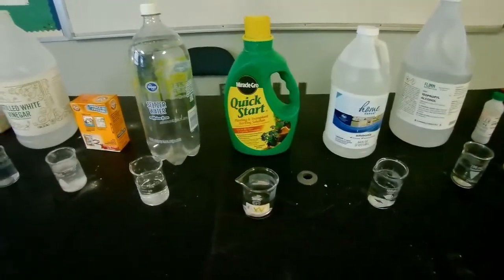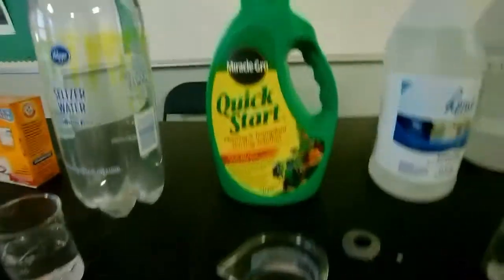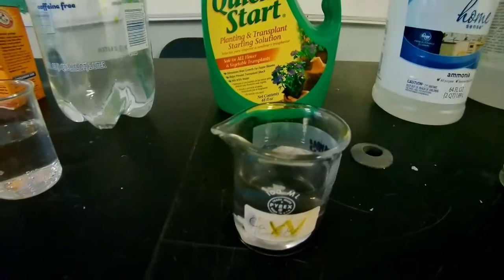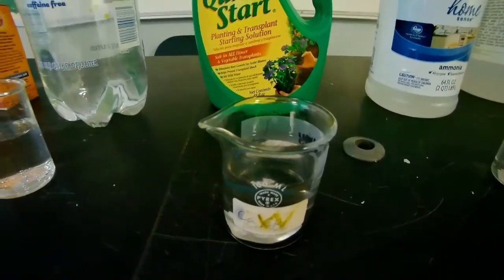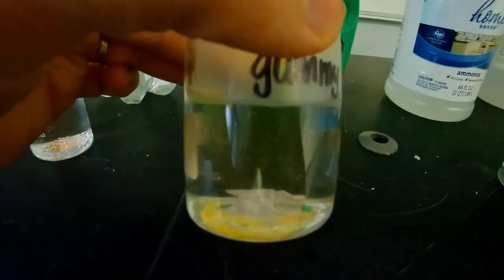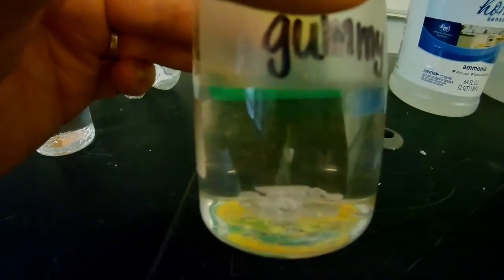All right, our next contender, chemical number 5, is going to be Miracle-Gro fertilizer. Fertilizer is something we'll be talking about over the course of the year. So let's talk about the chemistry of it. Here's our color of it. Again, it's partially dissolved in water. You can see it's a white substance at the bottom here. Some of it dissolved in water, some of it still at the bottom.